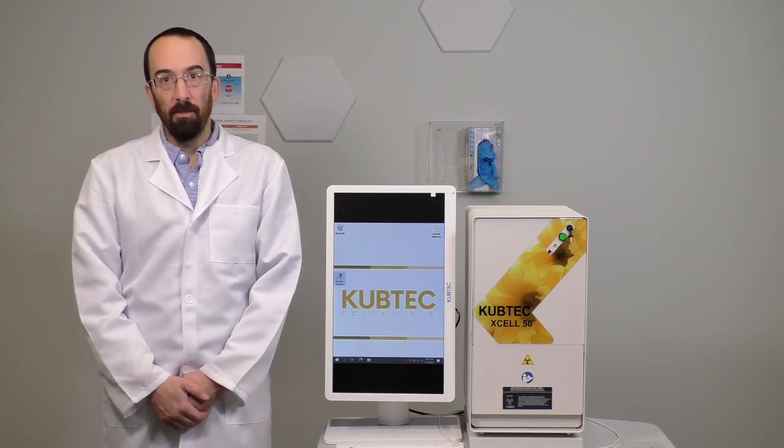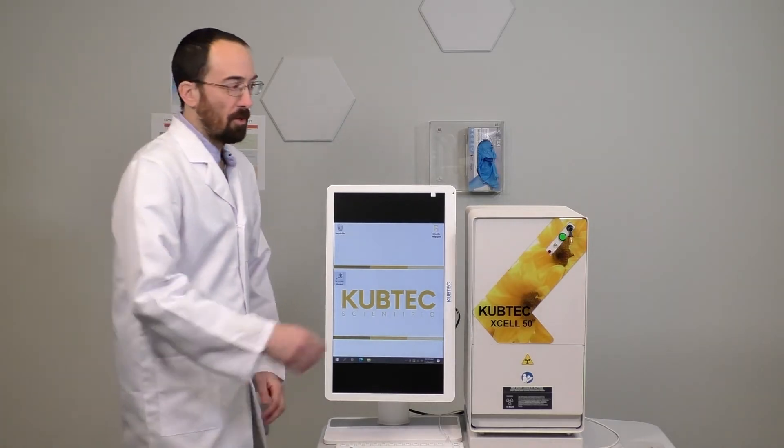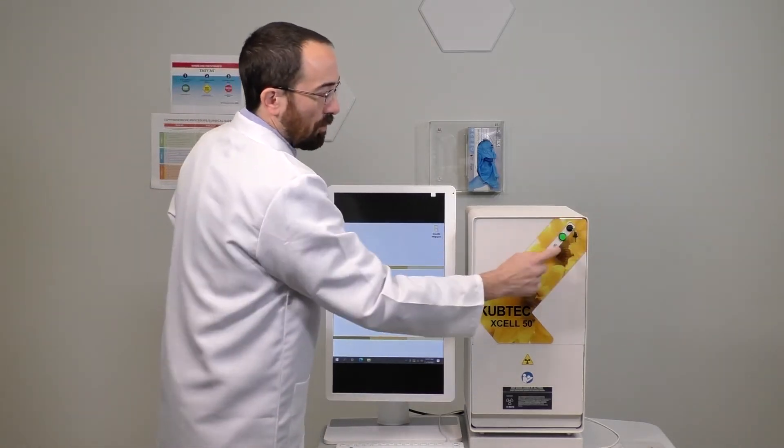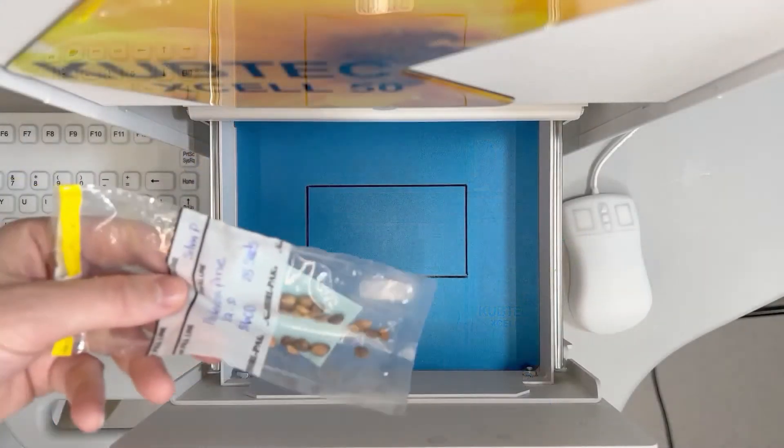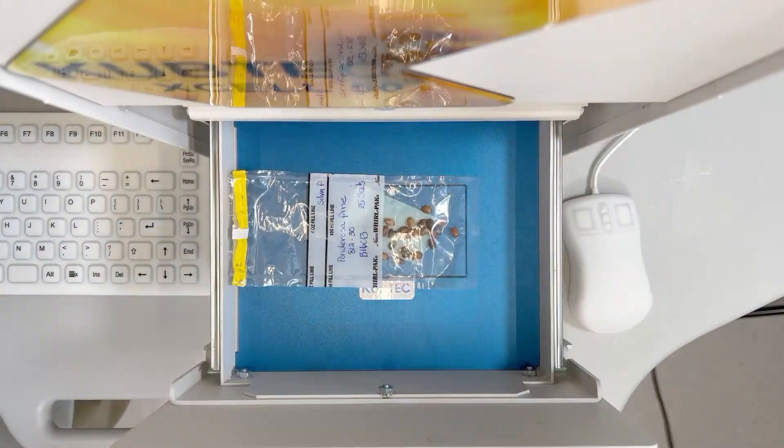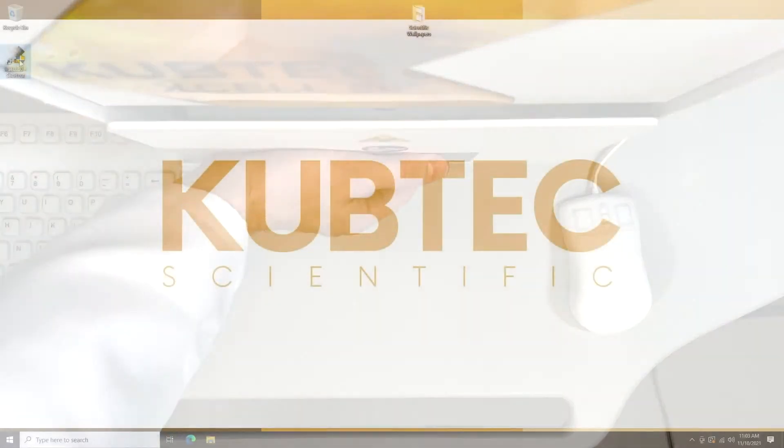The XL50 is extremely easy to use. Simply turn the key, press the green button, and you are now ready to go. Put the sample in, and then click on our proprietary XL50 Digisource software.